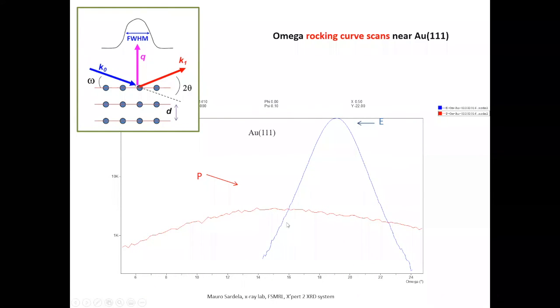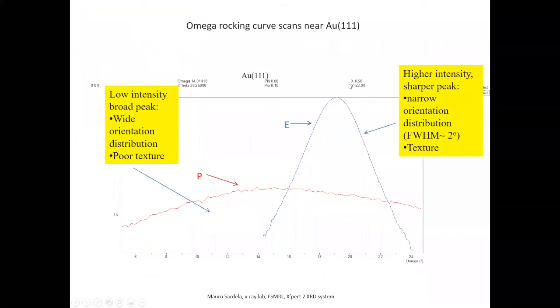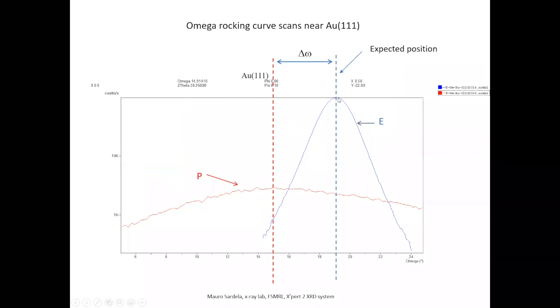So basically what you have is something very common, a crystallographic tilt between the film and the substrate, where the film, instead of growing in the same orientation, gets a tilt. In this case, it was a fraction of a degree or a degree. And then basically this is what we did.